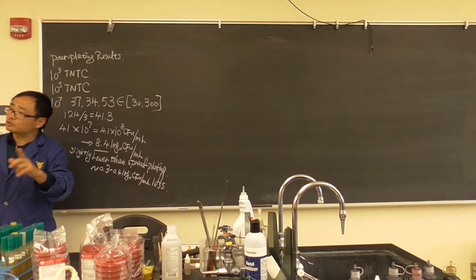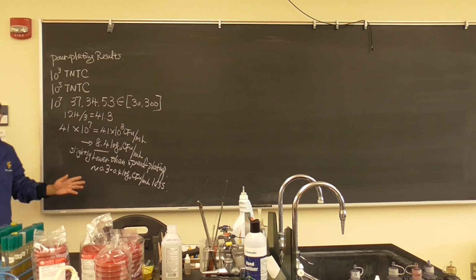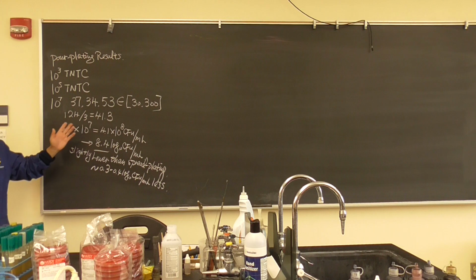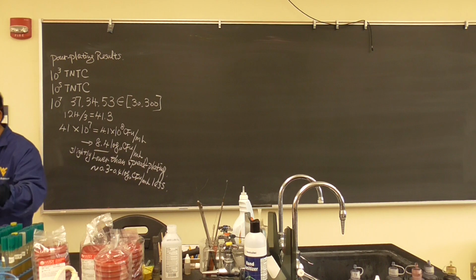So obviously you can see which one you like. You definitely like spread plating. It is much easier and much clearer, you get the quality. And this one is kind of confusing sometimes. Now, why do people do this? There's 2 reasons. Number 1, some people are just lazy, they don't want to mix agar on a separate day. They just want to mix up everything. Makes their life easy.